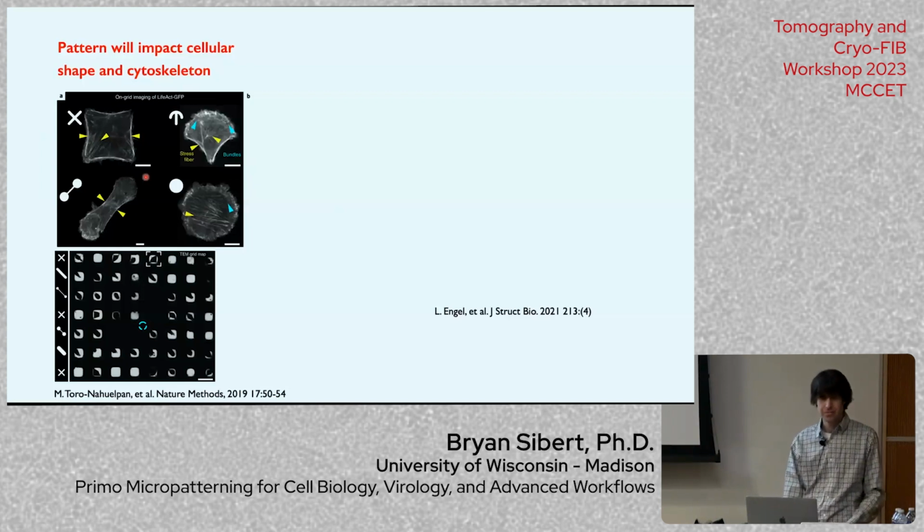Okay, thanks, Brian. Very interesting talk. I just have two questions. The first is about the choice of grid. Do we have to choose the grid with continuous carbon film, or will a common grid be okay?